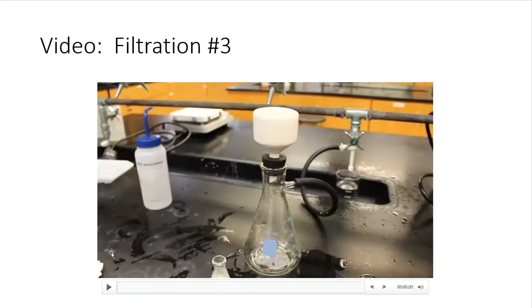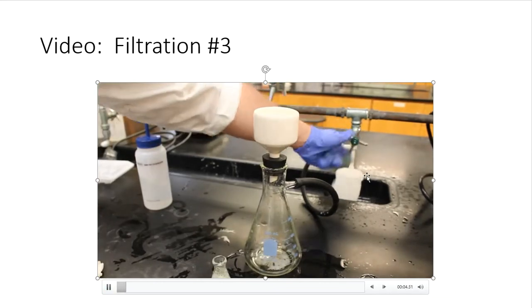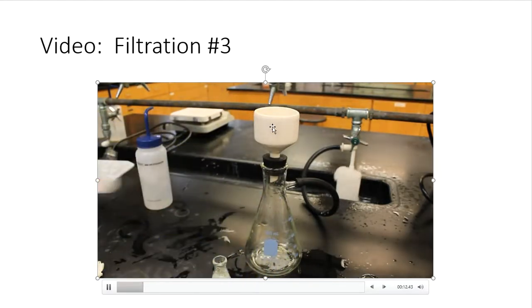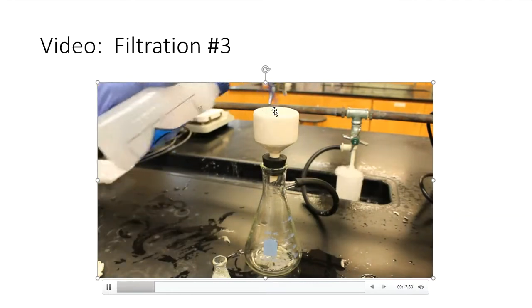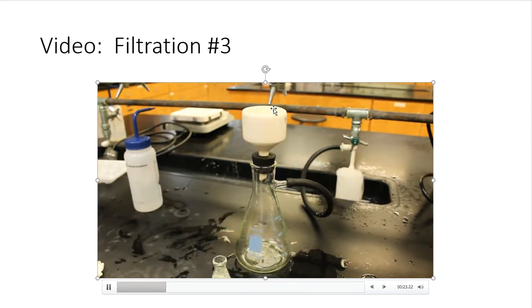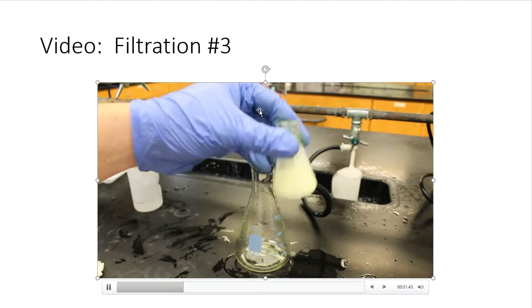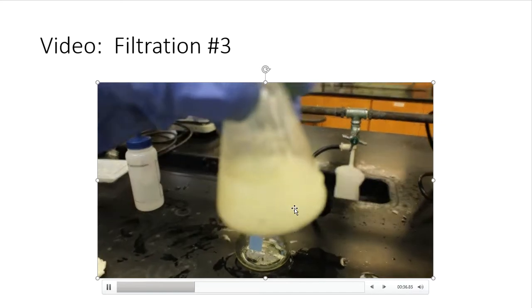All right, so here's filtration number 3, and filtration number 3 is the methyl benzoate. So again, I go back, turn on the aspirator. Once more, another piece of filter paper goes into the Buchner funnel, pre-wet, seat the filter paper, make sure all the holes are stopped up. And we do all of that before we filter it. Okay, so there's my product. That looks different than the first 2 already, right?